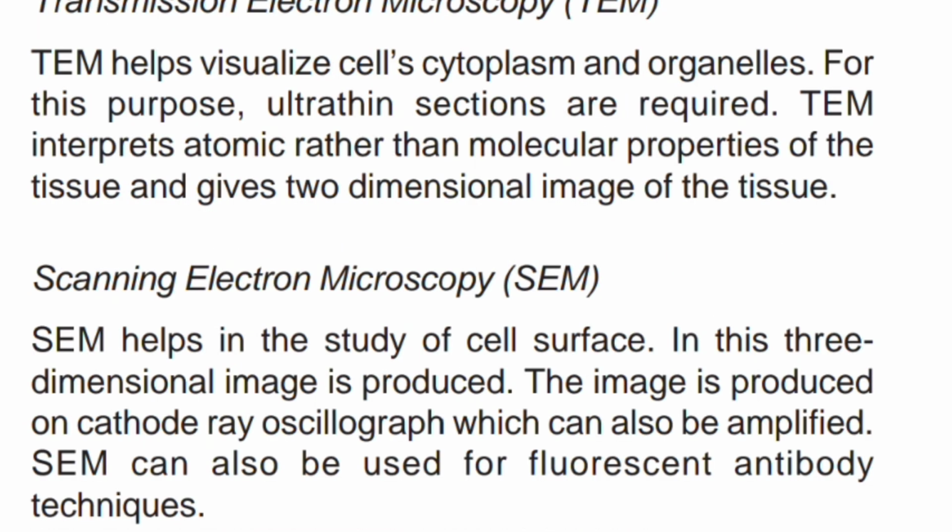Transmission electron microscopy (TEM) helps visualize cells, cytoplasm, and organelles. For this purpose, ultra-thin sections are required. TEM interprets atomic rather than molecular properties of the tissues and gives two-dimensional image of the tissue.